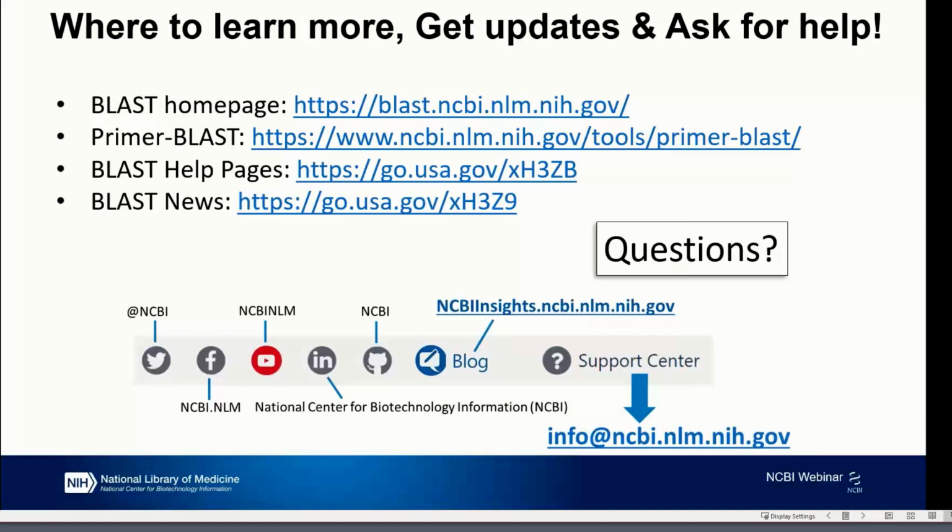Great, we have a number of questions. Let's go ahead and start off with templates. One of the viewers today was interested in the Primer-BLAST where you showed that you could run it against several sequences. And he was interested in, is it possible to run Primer-BLAST against several genomic assemblies all at one time? Yes, it's possible. You can't do it in the way that I did it today. So there is a way to, let me go back to my web browser here.